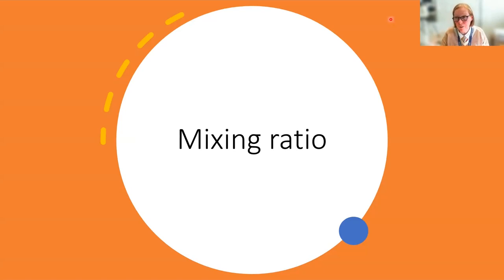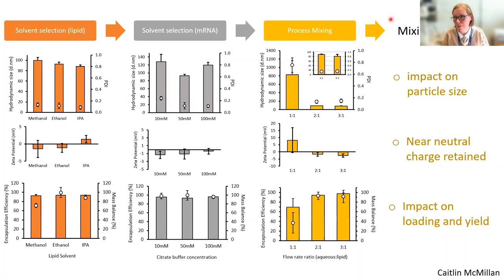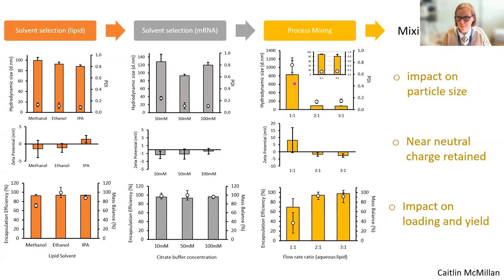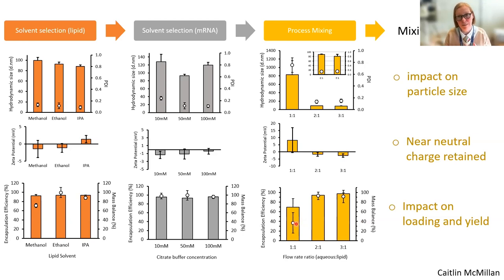What about the parameters we can control, specifically mixing ratio? This work was done with the PNI NanoAssemblr. We adjusted mixing ratio from one-to-one alcohol to buffer, to two-to-one buffer to ethanol, and three-to-one. At the one-to-one we get very large particle size and very large PDI — it's not a nice product. If you go two-to-one and three-to-one, particle size comes down and levels off. Zeta potential is messy at one-to-one for LNPs, and loading is low with even lower recovery of mRNA.